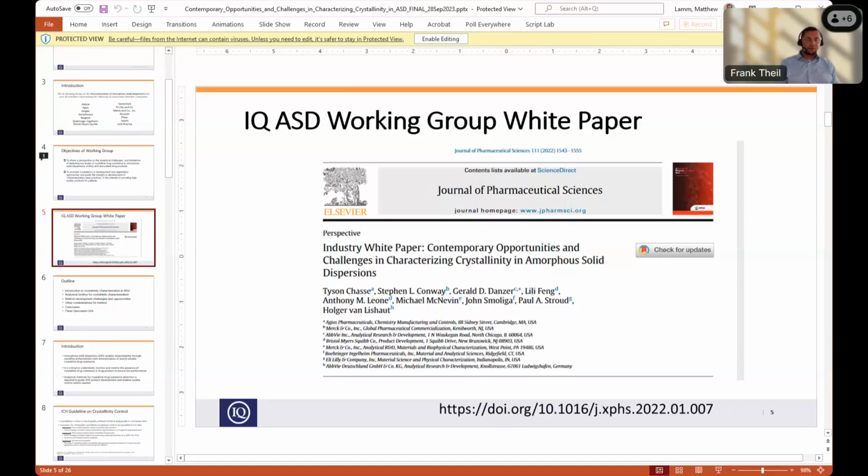What people would like to show is that you have the spectra of the crystalline drug substance and then have a response from your chemometric model that is an exact overlap of the crystalline drug substance spectrum. If we are talking about ASDs and spectroscopy, you will not only interrogate the gain in crystallinity in most cases, but also the loss of amorphicity, and also interactions between the polymer and the API that are changing with growing crystalline content.